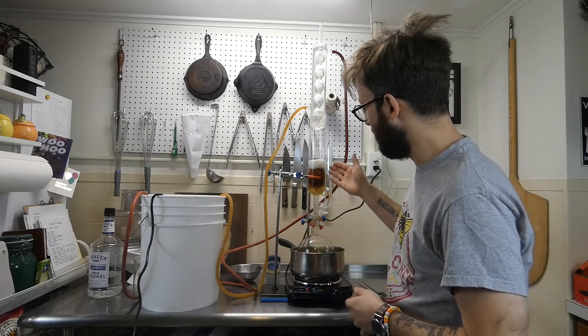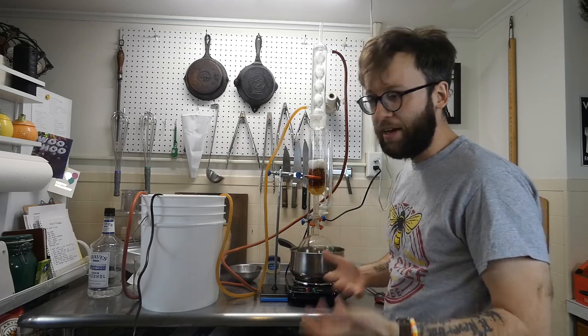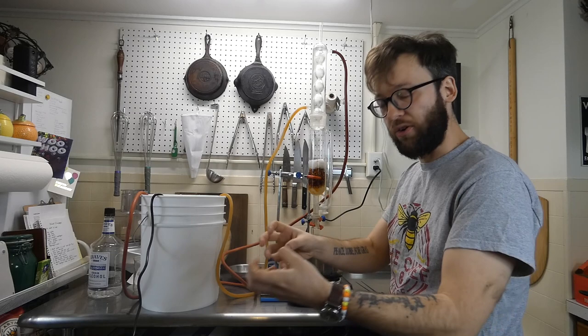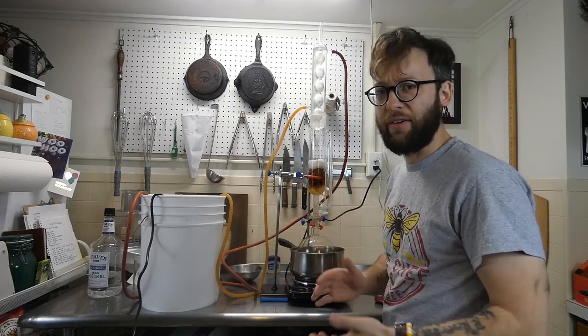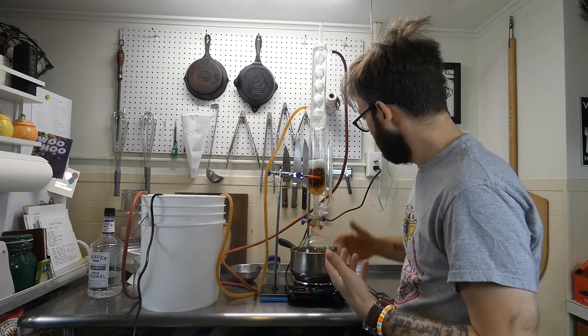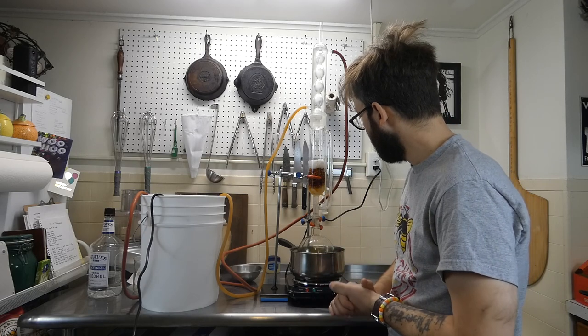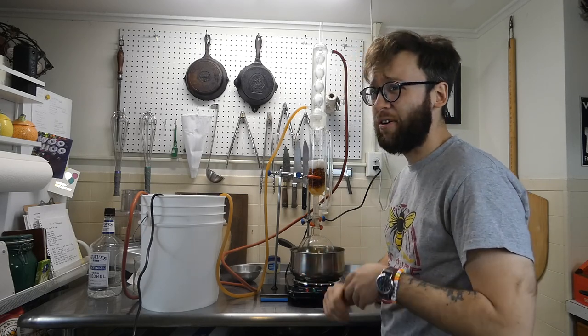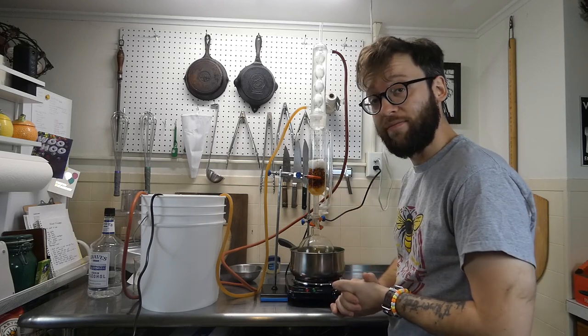Obviously there will be some other things in our extraction just because I don't have the capacity to extract certain chemicals out, so it's going to be capsaicin and some other different chemicals from the pepper plant itself. So as this progresses, we will check in on it. I expect this will take anywhere between 3.5 to 5 hours total to extract this. So yeah, I'll see you in a bit.